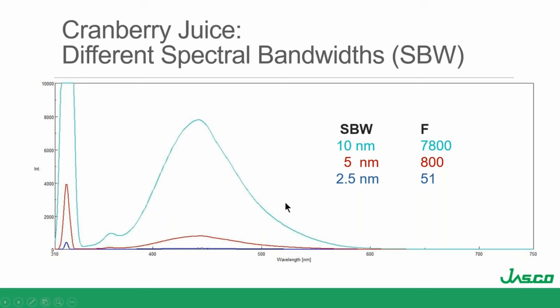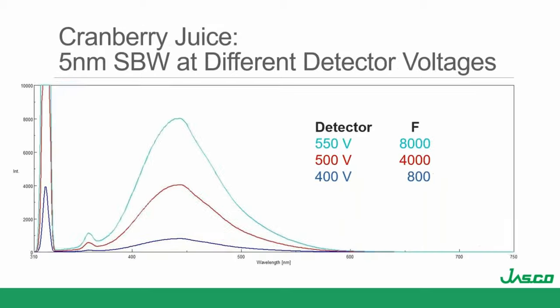The most important take-home here is: I get a lot of intensity by changing the spectral bandwidth. But do I need to go to 10 nanometers? I am starting to blur things — looking at the scatter band, you can see how much broadening you get going from 2 to 5 to 10 nm. It could be a big deal if you have a narrow Stokes shift.